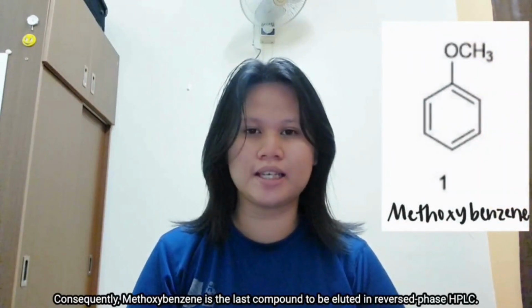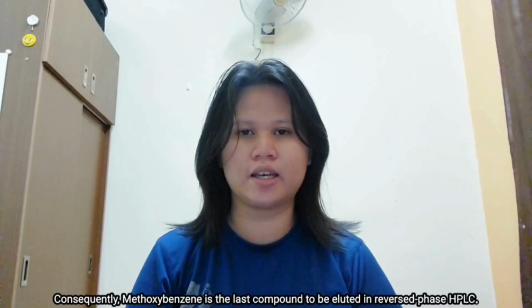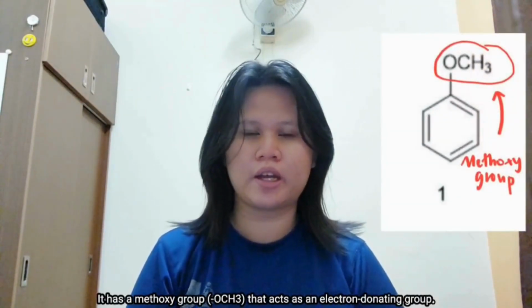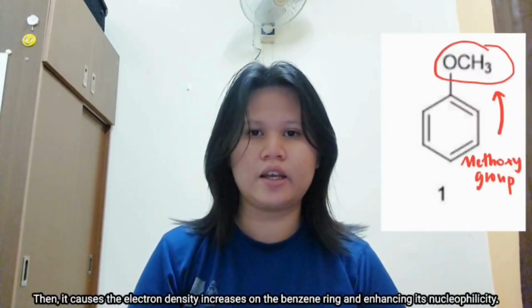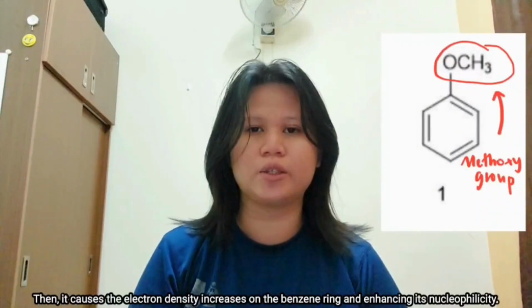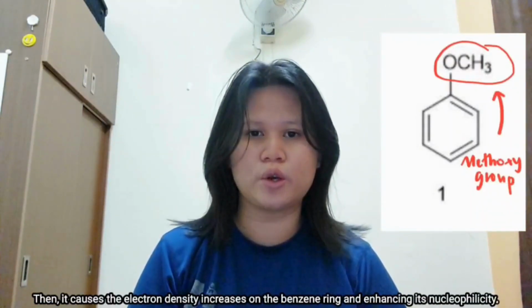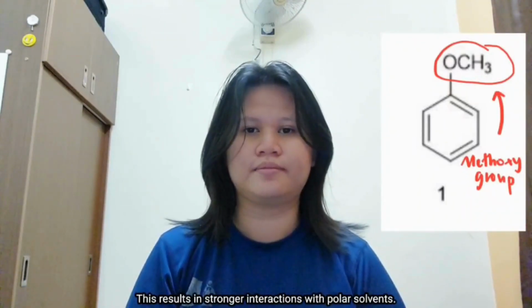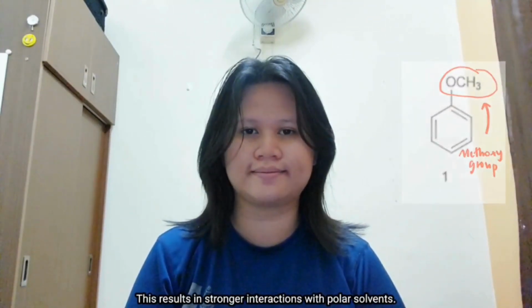Consequently, methoxybenzene is the last compound to be eluted in reverse phase HPLC. It has a methoxy group that acts as an electron donating group. Then, the electron density increases on the benzene ring, enhancing its nucleophilicity. This results in stronger interactions with the polar solvents.